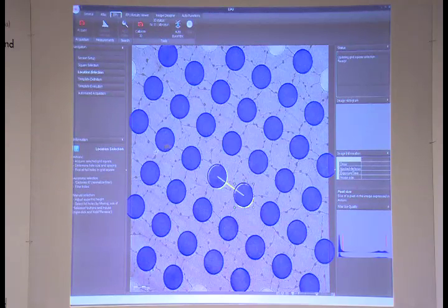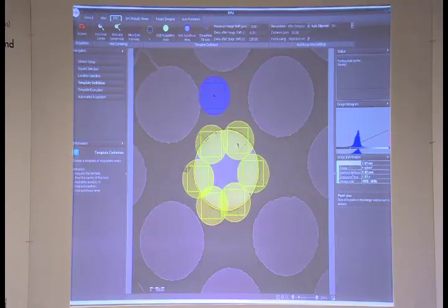And once we have these holes, we can then try and work out some acquisition schedule. So here in the yellow is going to be our exposure acquisition. So we can position 6 exposure shots around a single hole, and we can control the optics so precisely that we really are at these positions.